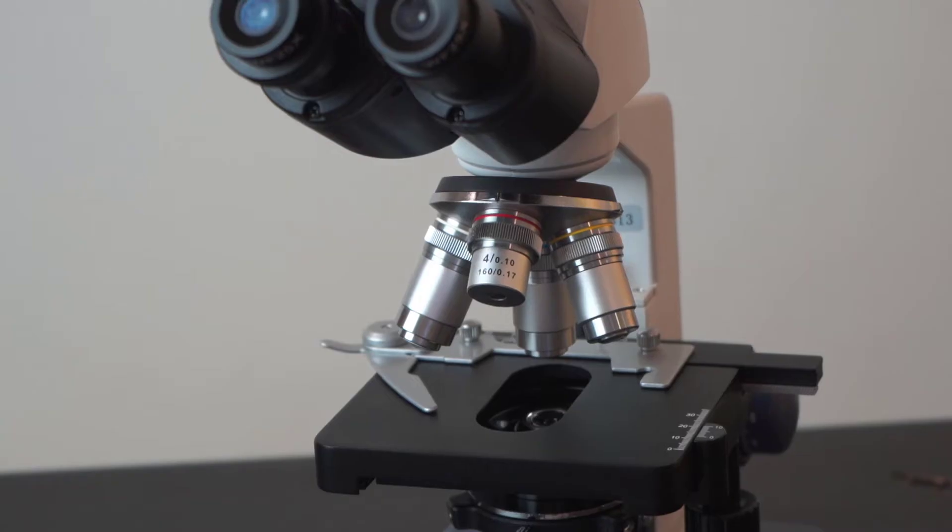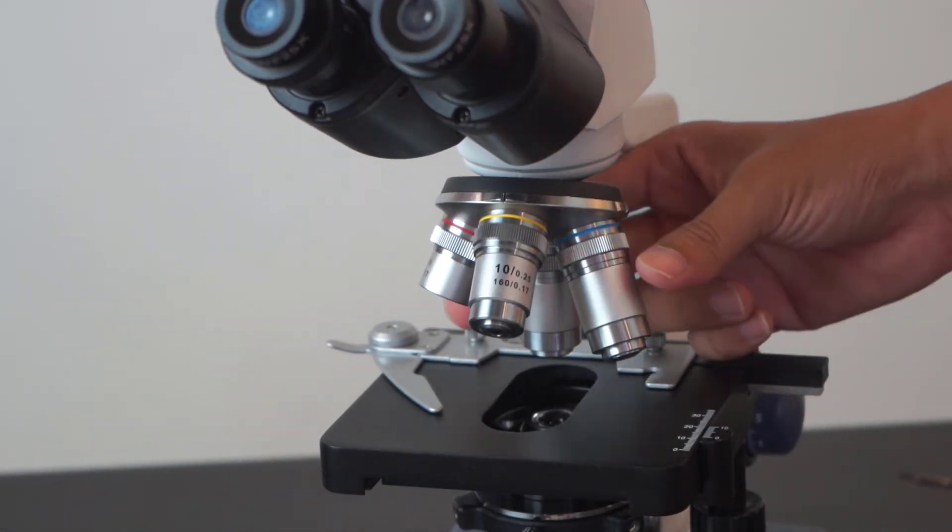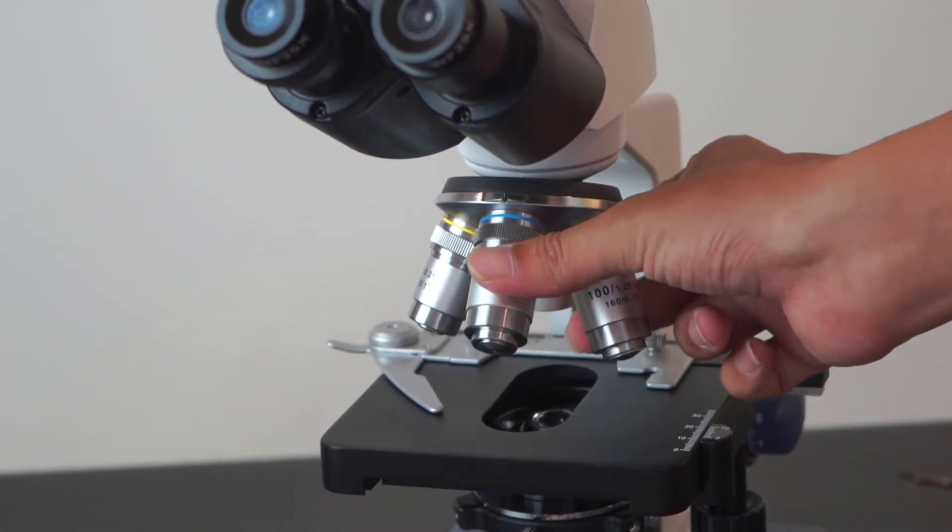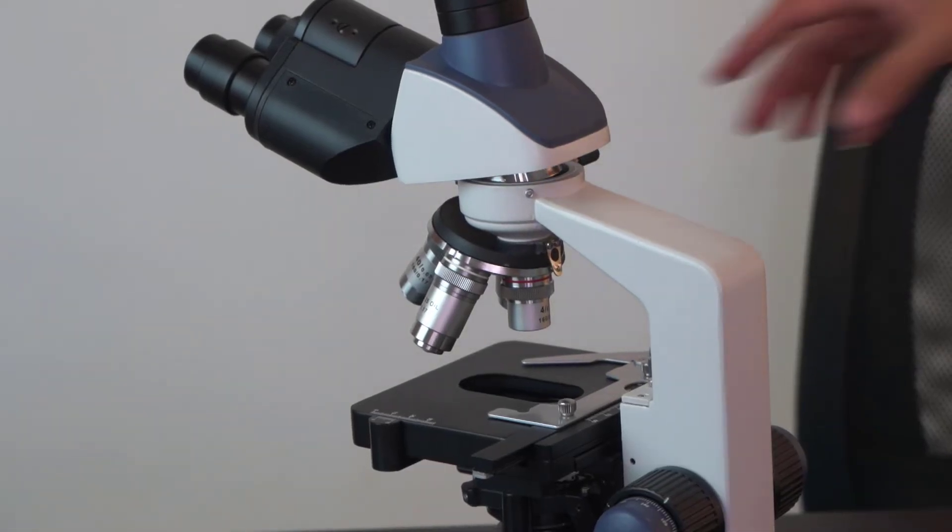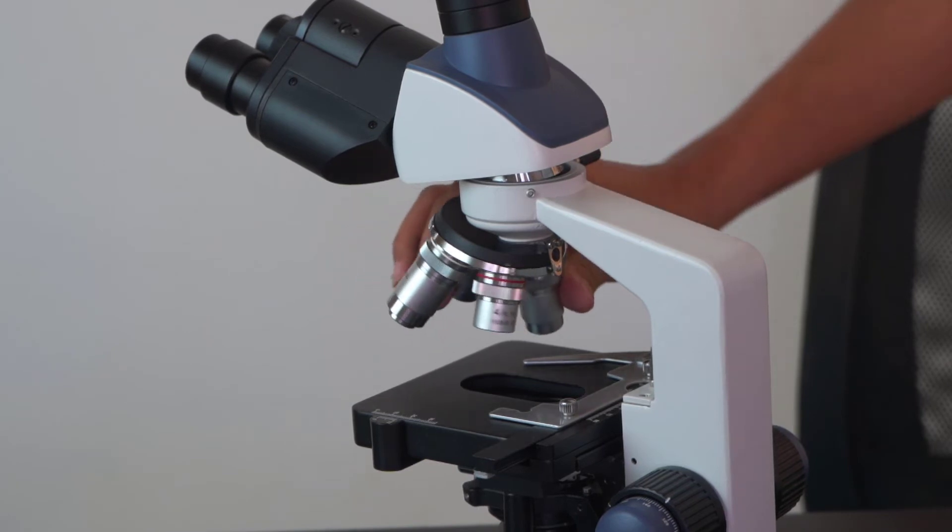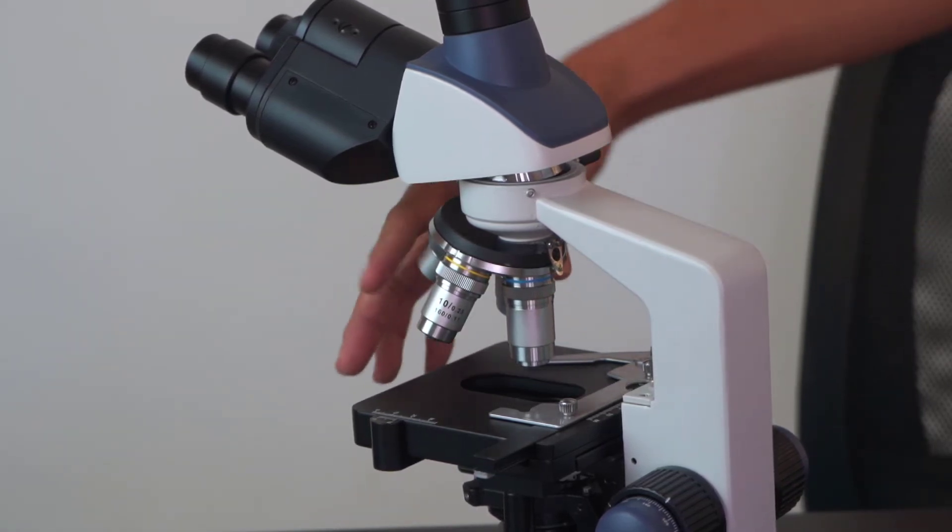To change the magnification, you can turn the turret to change the objectives. Always start with a low magnification and work your way to a higher magnification with the objectives.